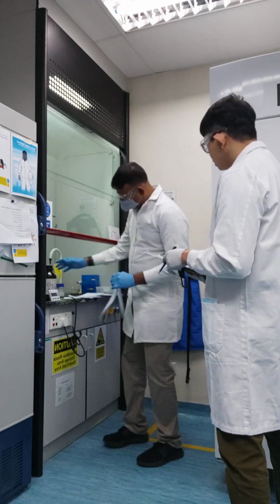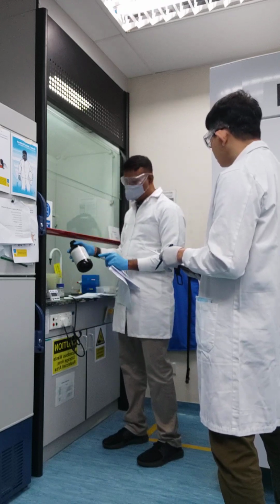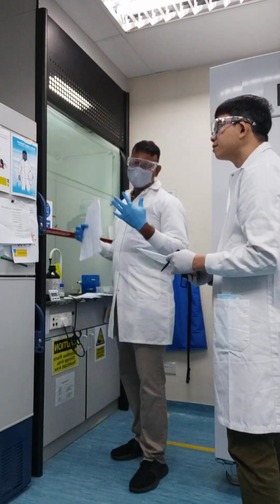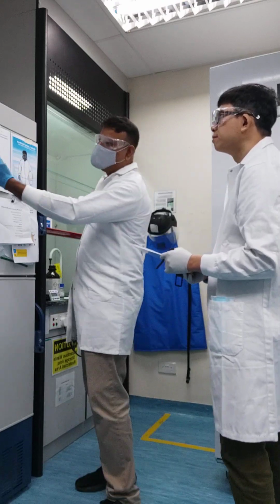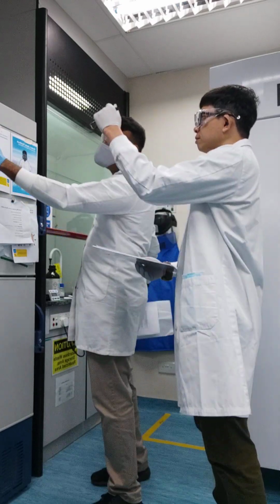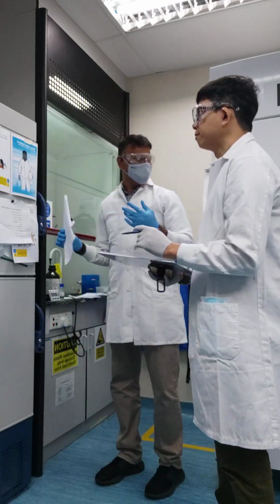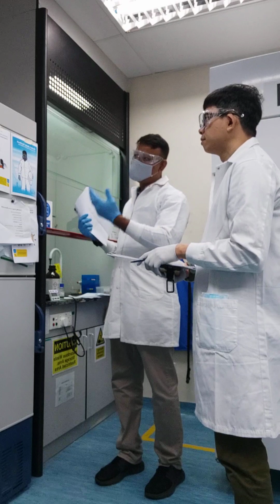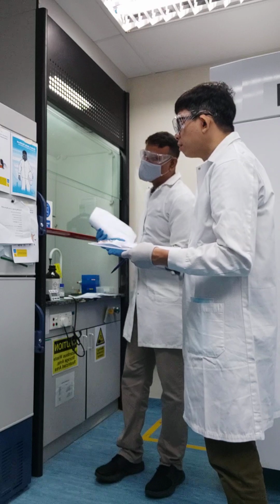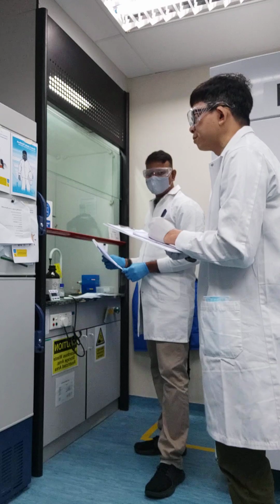The third step is recognizing the hazard symbols of the chemicals that you are handling. What does this symbol mean? To facilitate your understanding, I have made a chart here. Here you have the symbol. Currently we have a symbol which indicates corrosive, and it is also an irritant. Because it is a chemical compound, we need to protect ourselves with the required PPE. Please make some notes.